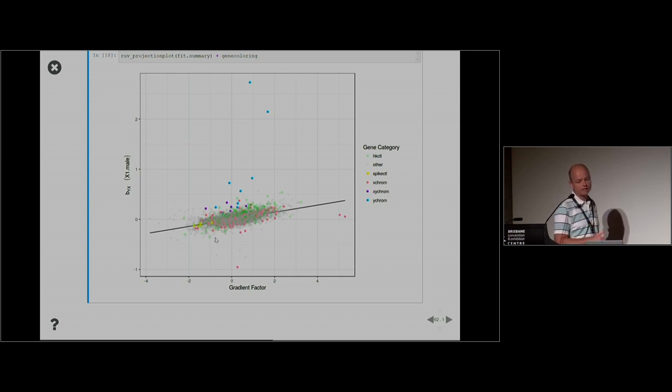Essentially, there are different ways of fitting this black line to these negative controls. In any case, you can use a plot like this to tip you off if something looks really wrong. For example, if this black line just was not fitting the green dots at all, you'd know that something was wrong. And that does occasionally happen.